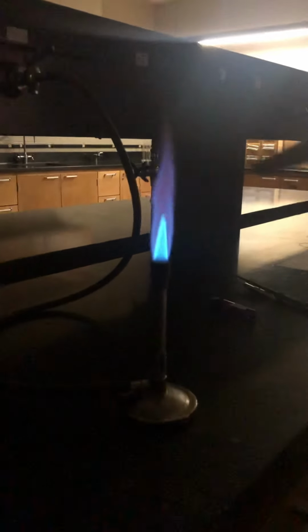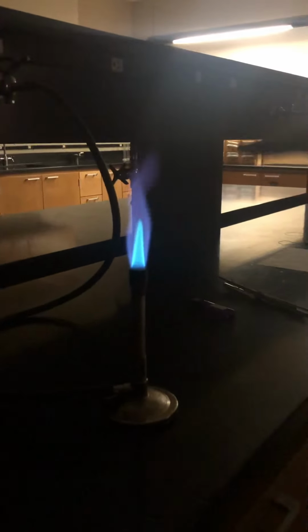Okay, and we are going to see different colors. Now, if I was you, I would have a pencil and paper. I should have told you that sooner, but I would have a pencil and paper. All right, so come back. Okay, so I know it's dark. Here's all our solutions. Okay, there's our flame. Notice the flame. I have a flame within a flame. That's what you want.